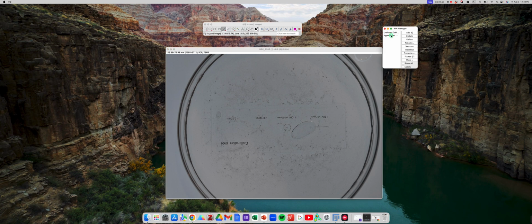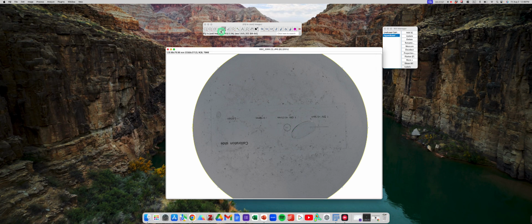Zoom out. Apply your ROI with hyperdilute. Click edit and click clear outside. Now let's draw a couple boxes around our lettering, like calibration slide. So click the rectangle and draw a little box around them. Go back to edit and click clear. That'll remove it. And then do the same. You might as well do the same here because we don't want the lettering to mess this up. Click edit and clear.